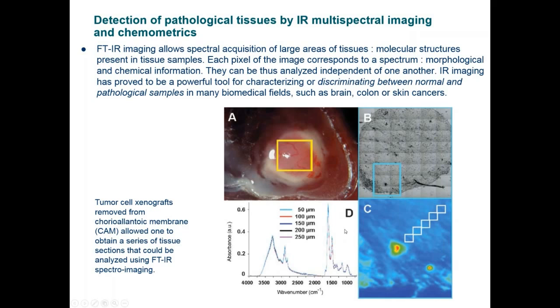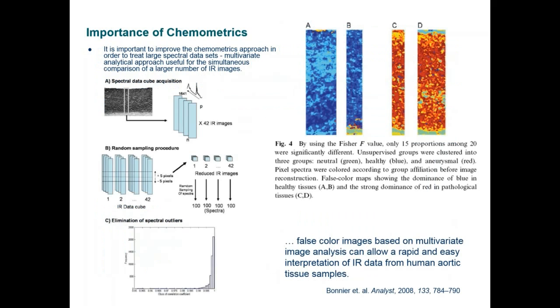However, even though this spectra is shown clearly in this two-dimensional diagram, this IR map shows the distribution of those species within a space. Now, in chemometrics, this can be done by doing time sequence measurements, which allow you to gather the spectra in one dimension, and then on another dimension, look at the changes in the distribution over space.